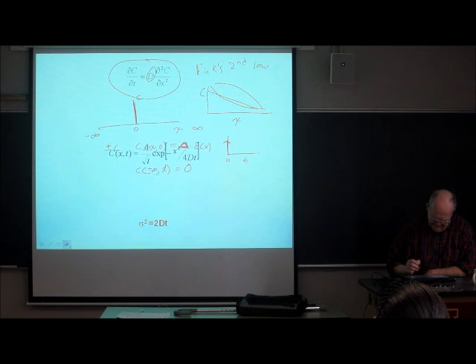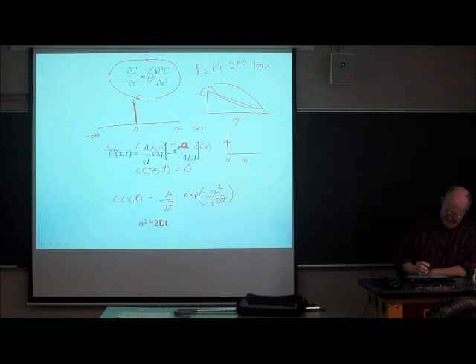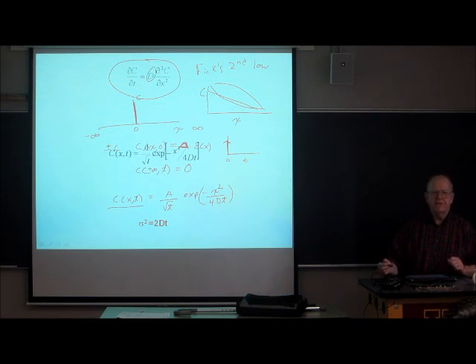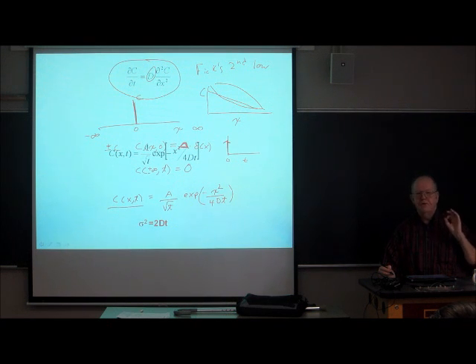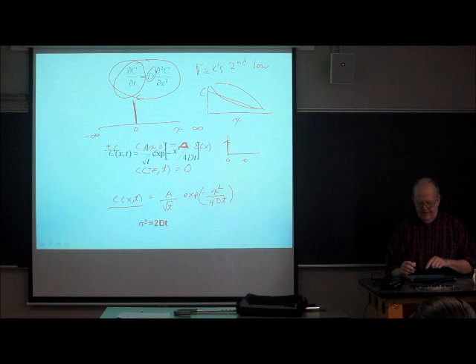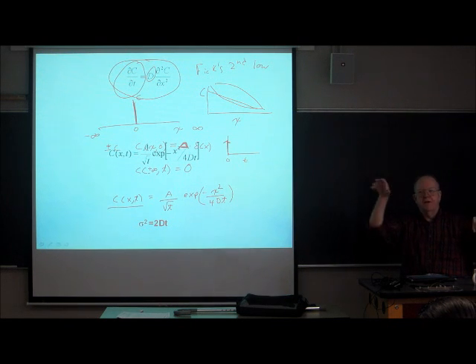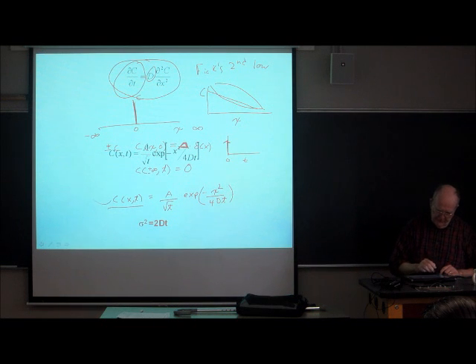Let me go to the next slide. I didn't mean to write where I had that equation. I'm going to have to write the equation for you. This equation is a solution of the differential equation. You can prove that, I'm not going to show you, but you can prove it easily by taking the equation and taking the first time derivative. Then take the same equation and take the second x derivative, multiply the second x derivative by D, and you'll see that in fact the first time derivative is equal to D times the second distance derivative. So this is the solution of that.